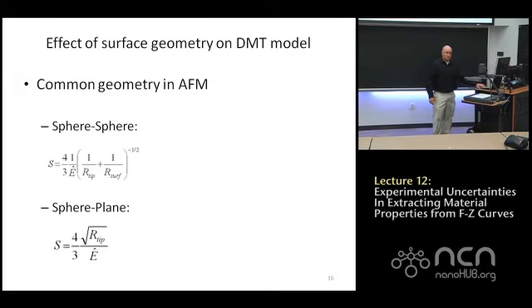And just to point out, the question was also about large indentations. These are all small indentation models. DMT is always good for just small indentations. With large indentations, the overall geometry of the tip beyond just the elliptical or spherical description comes in. Could you say a word about what those models are?